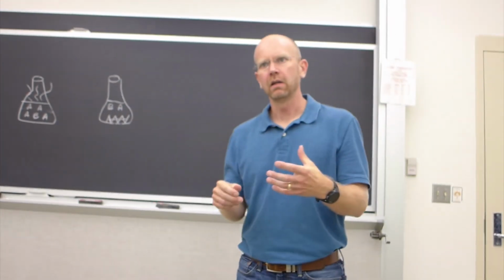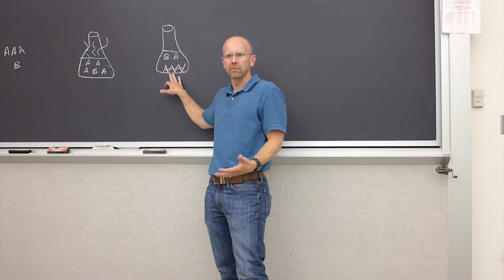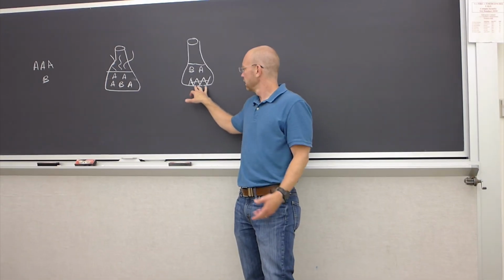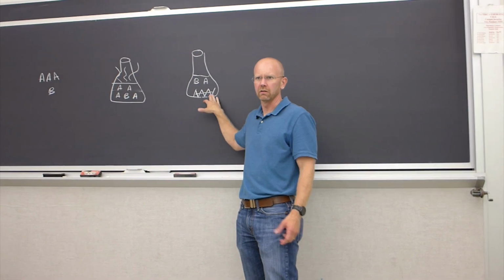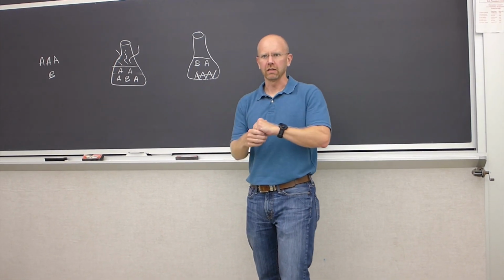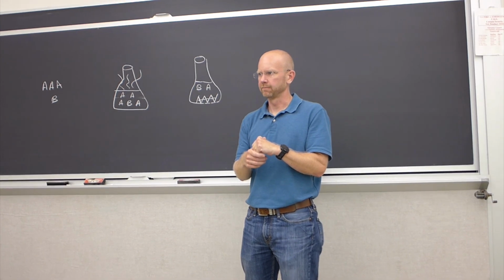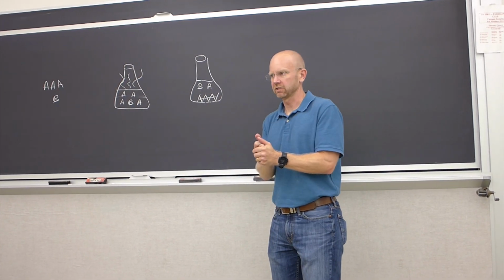So then after that, once it's at room temperature, or once you see a substantial amount of solid there, right, then you almost always have to break up the crystals. Usually it forms kind of a layer along the bottom, so take a spatula, break them up, and then swirl it and use a vacuum filtration to isolate. Okay? So that's the general technique.